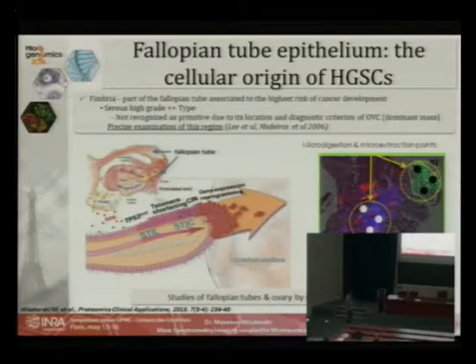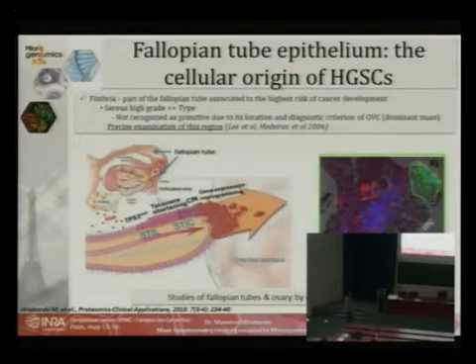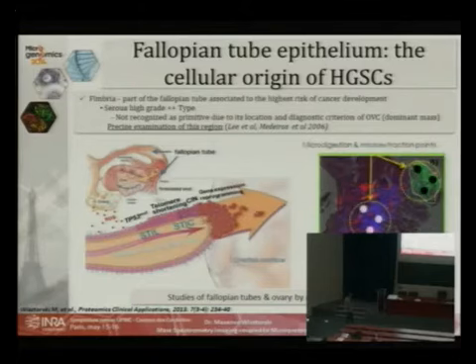We performed a first analysis on 4 patients, and the particularity of these patients is that they developed a small tumor in the fimbria part. There is no tumor inside the ovary part, only on the fimbria part. We performed our strategy, first by realizing mass spectrometry imaging to obtain the region of the tumor, and after by making the microproteomics analysis on the tumor part and on the benign part on 4 patients.